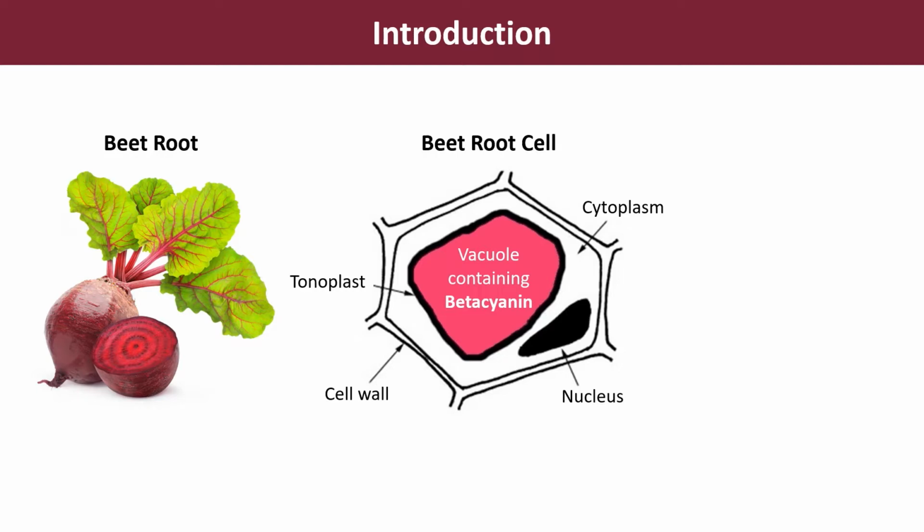It's found inside the vacuole, and the vacuole itself is surrounded in a membrane. That membrane is called a tonoplast. The cell itself is also surrounded in its own plasma membrane. And so if the membranes are damaged, the pigment leaks out. And since the pigment is colored, we can measure how much leakage and therefore infer when membranes are being damaged.